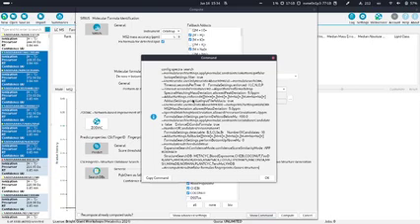And this is all the settings we now have. It seems very long, but this is only because all the default settings are included here. So if you copy this command, for example, and run it in a terminal, you should get the same results, or at least you should have the same configuration.